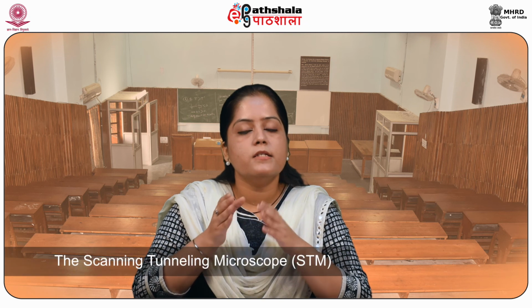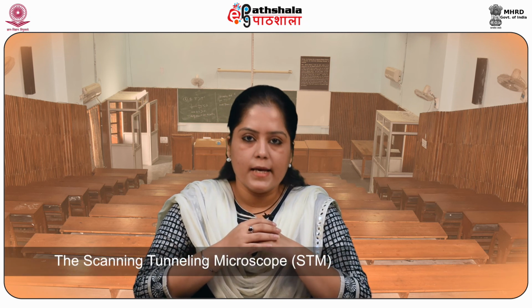The scanning tunneling microscope, STM, is widely used in both industrial and fundamental research to obtain atomic scale images of metal surfaces.